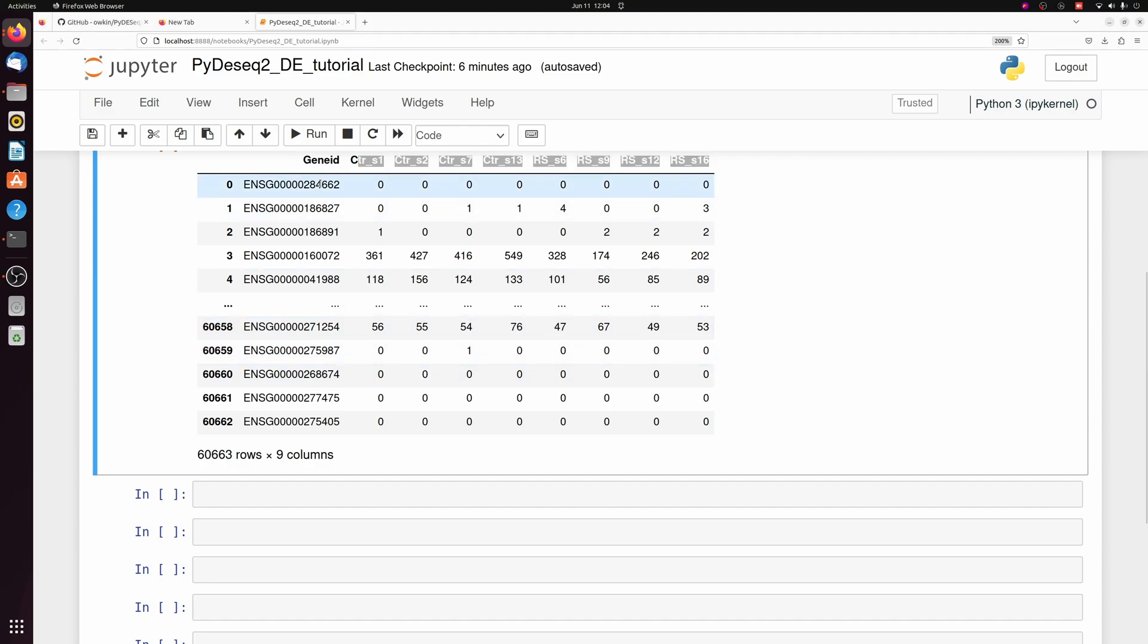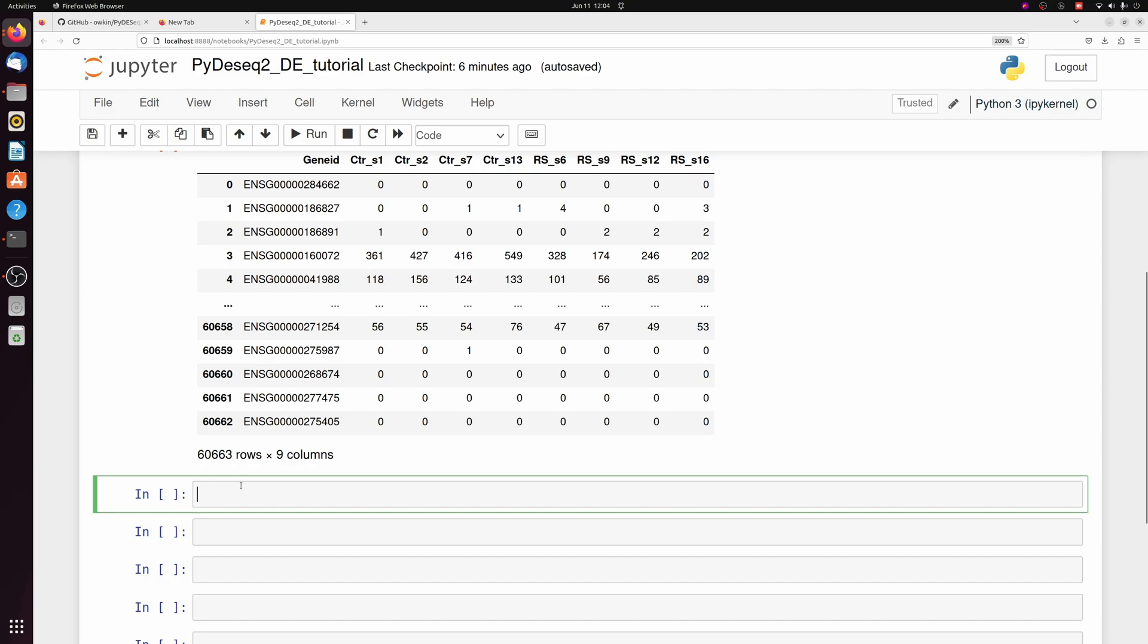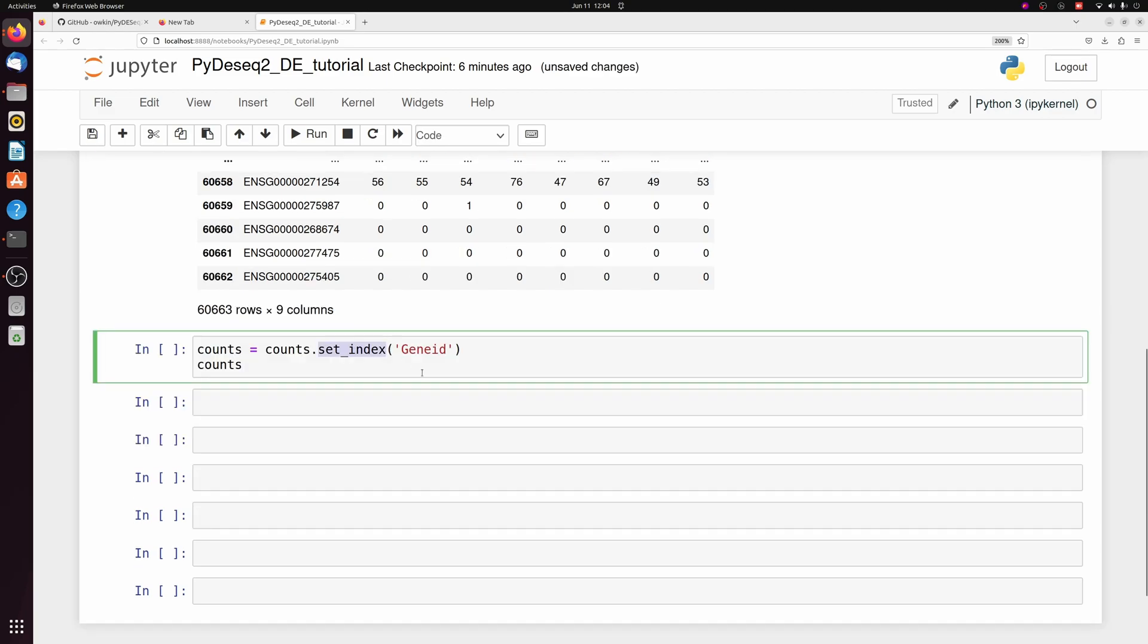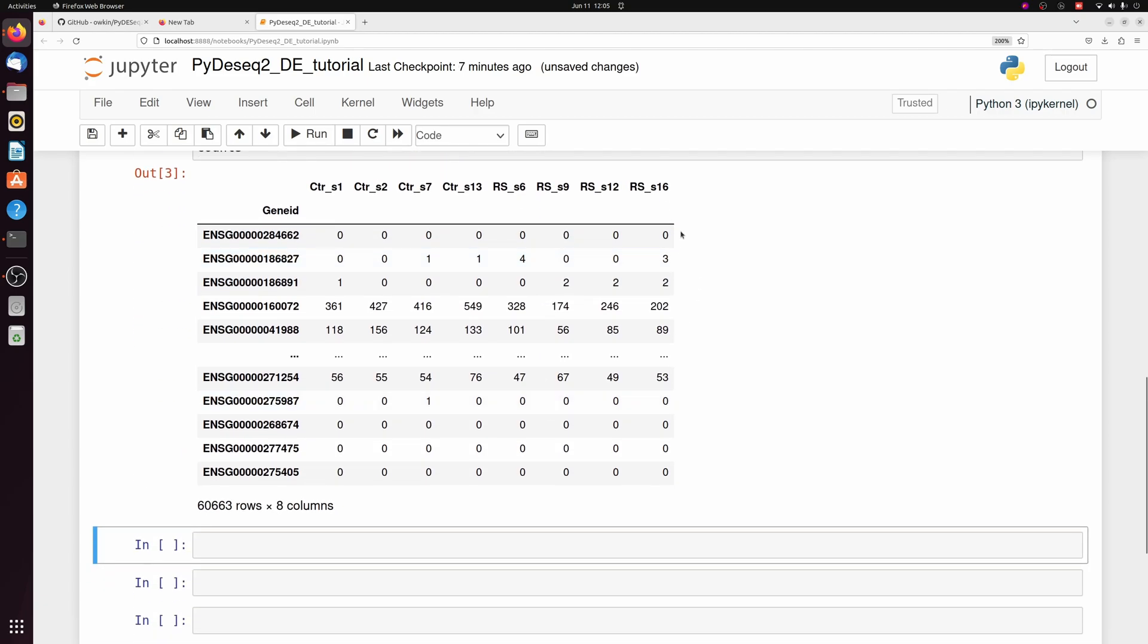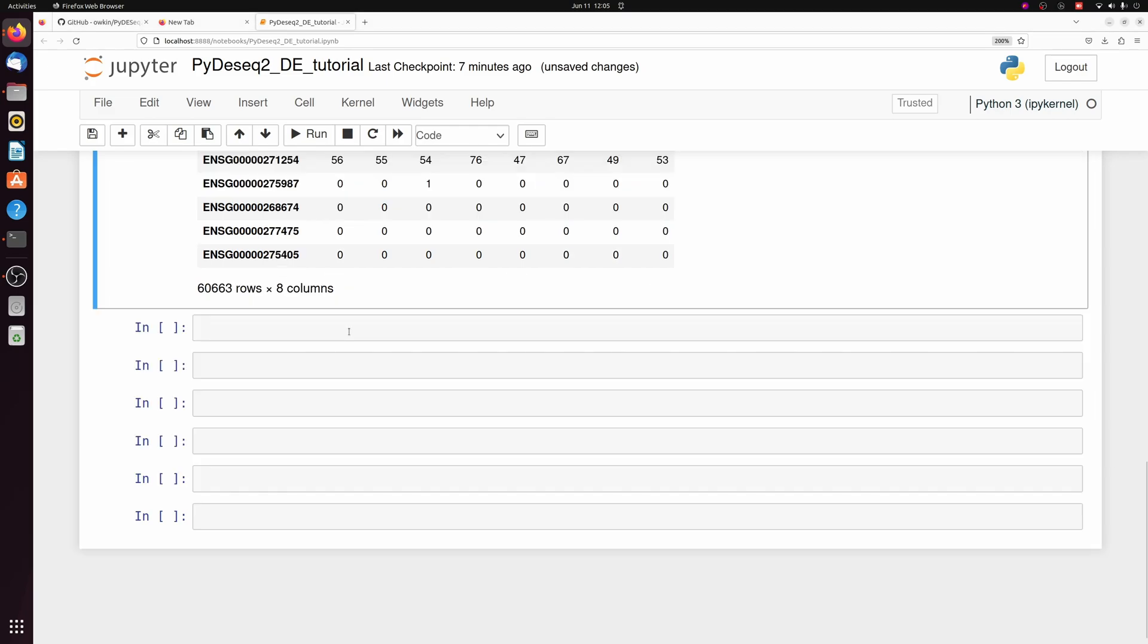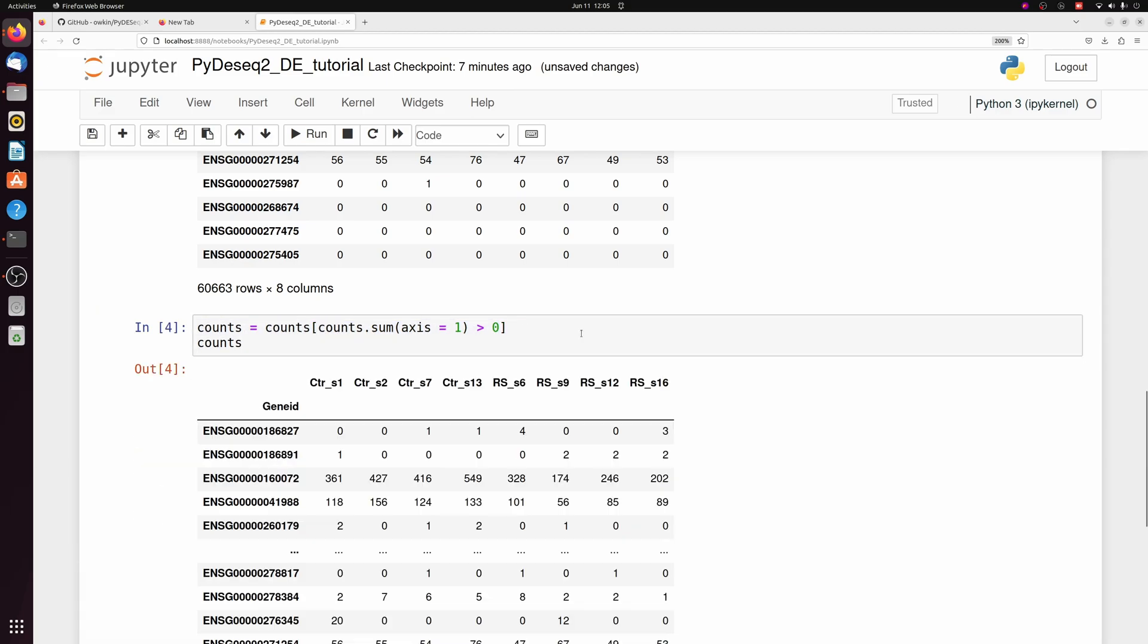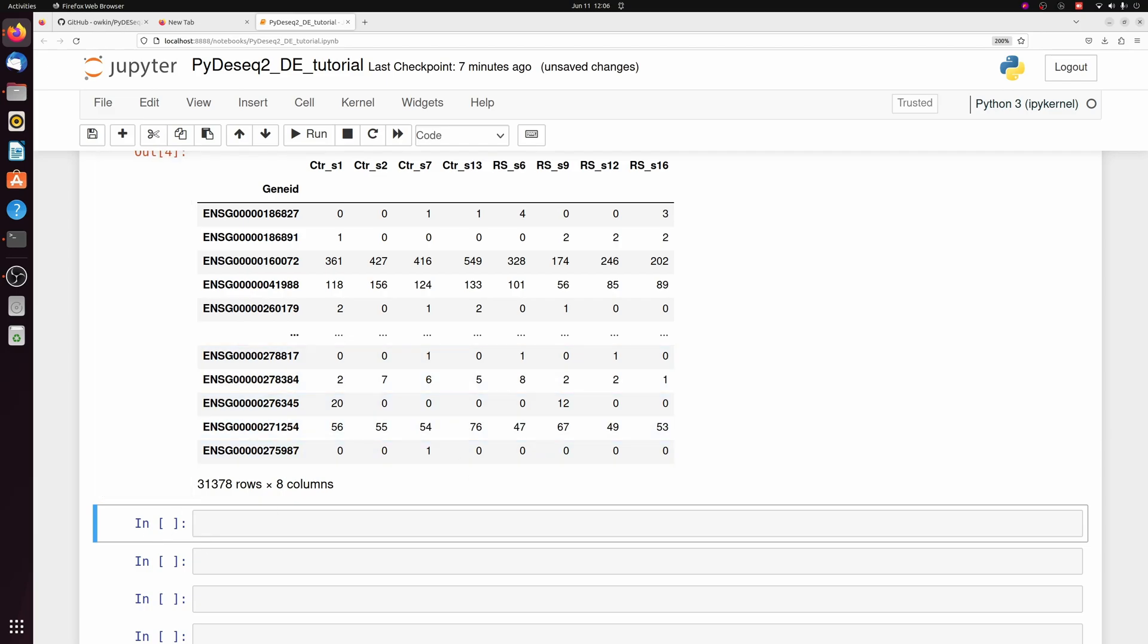So we have our counts table with our ensemble IDs and the samples. We have to make a few changes. First, we want to set the ensemble IDs to the actual data frame index column. The next thing we want to do is get rid of columns that only have zero counts. So we're just going to get the sum of each row and ask if it's greater than zero, and then filter on that. So we went from 60,000 features to 30,000.